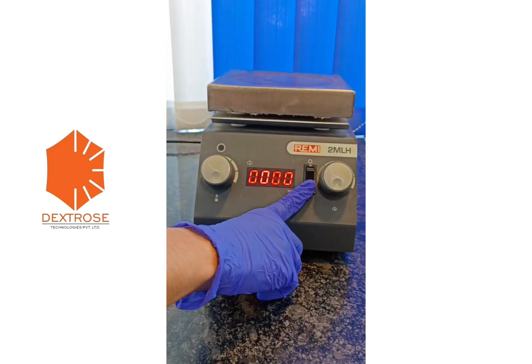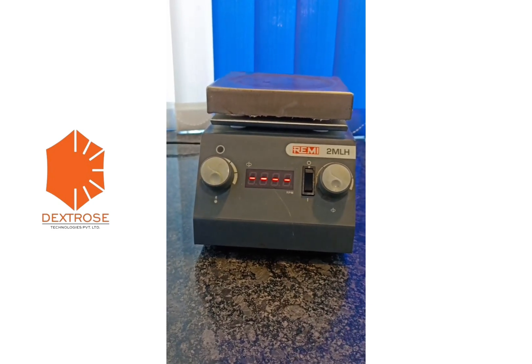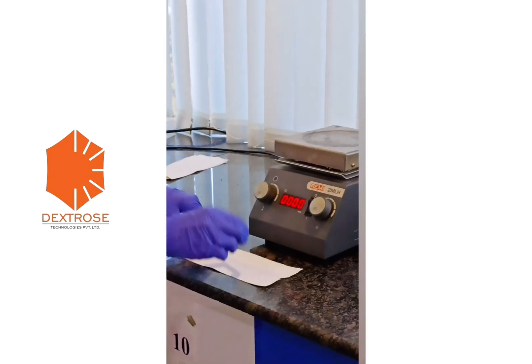Firstly you need to turn on the equipment — press the button. This is known as the magnetic bead, with which the stirring will happen and uniform mixing of the sample will take place.